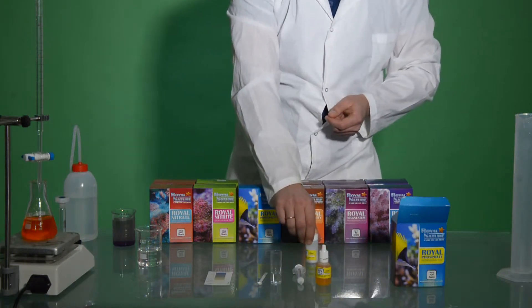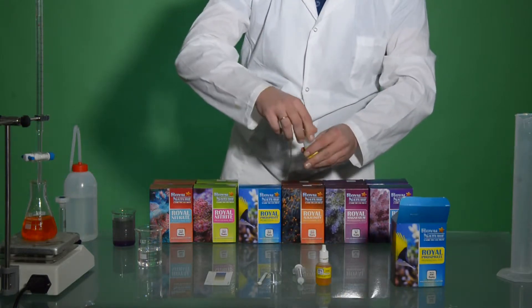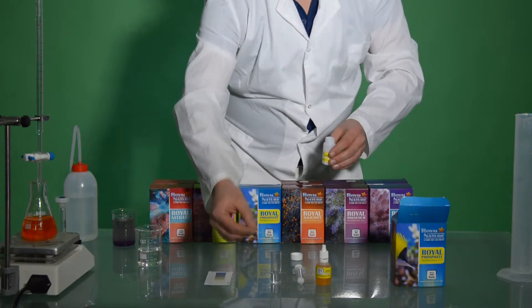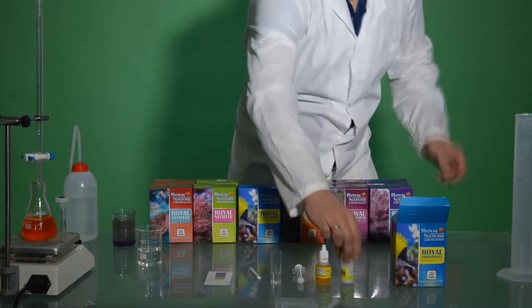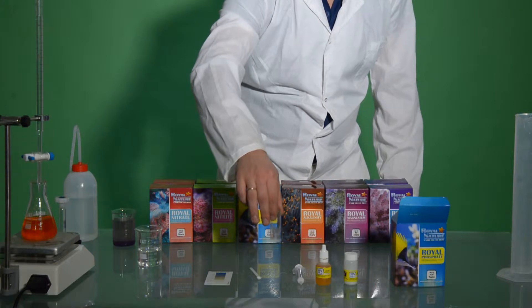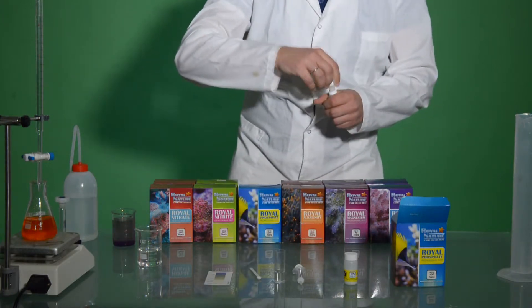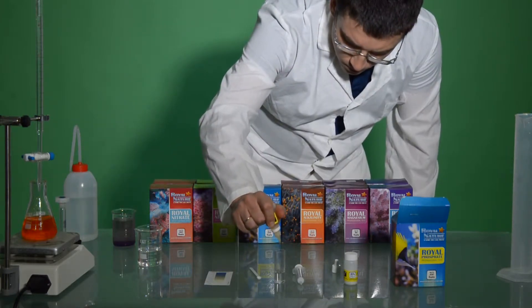Right now, we'll take one level of the measuring spoon of PO4-1, we'll put it inside the Test VL, and we'll swirl gently for about 10 seconds. Now we'll add 5 drops of PO4-2 to the Test VL, and we'll swirl gently for 10 to 20 seconds.